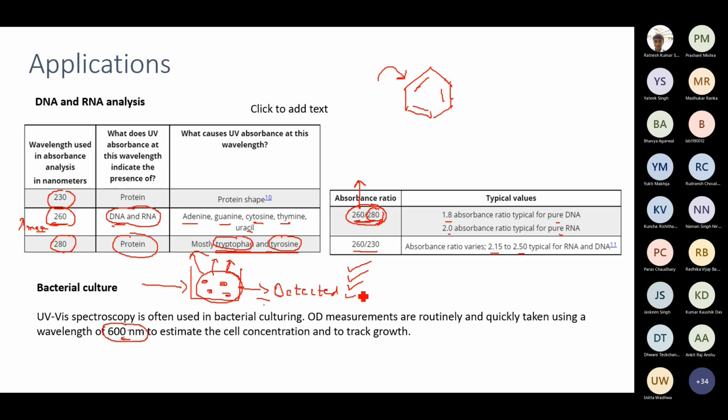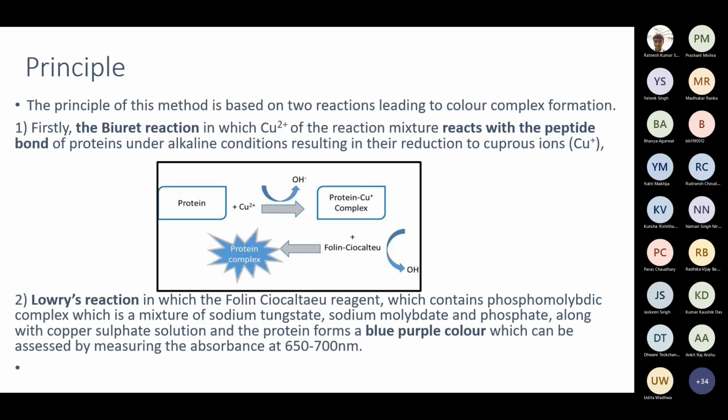So here, there was the application, and now we will move on to the practical component, in which we will determine the protein concentration using the Folin-Lowry method. So I will hand this over to Kritika ma'am, who will take the practical part.